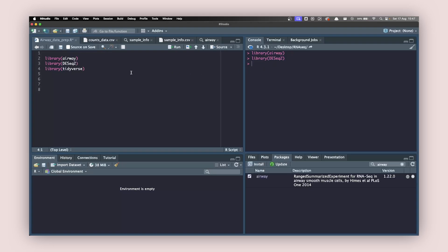One more package we're going to use is tidyverse. Tidyverse is a collection of packages that includes forcats, ggplot2, and also some operators like the pipe operator. So again, library tidyverse and hit Command+Enter. We're going to work with these three packages.